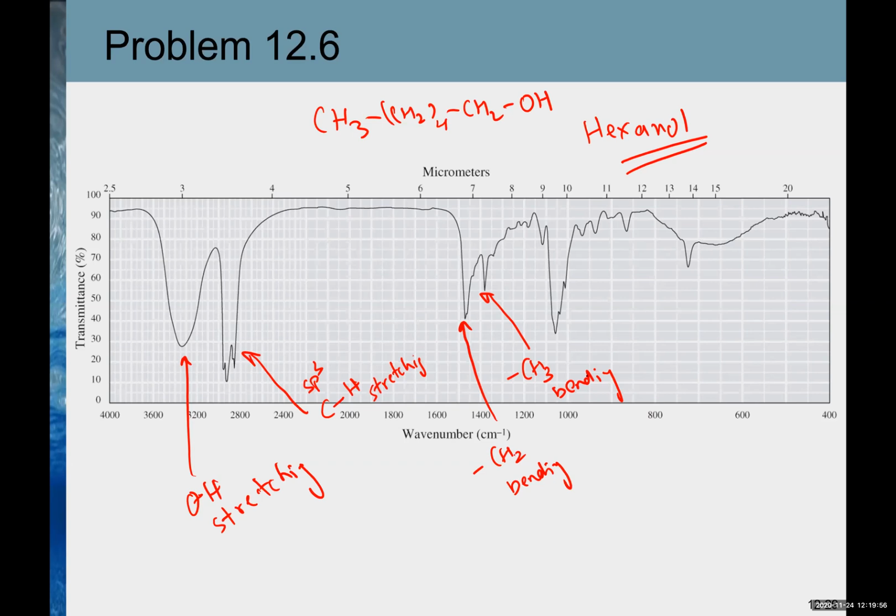Wouldn't that be the CO bond at like 1050? Yeah, CO. This is CO stretching. Yep, these are all the peaks for alcohol.